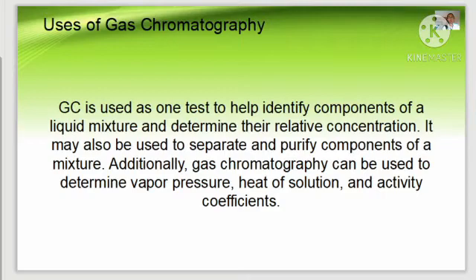So, chromatography can test blood alcohol, drug purity, food purity, and essential oil quality. GC may be used on either organic or inorganic analytes, but the sample must be volatile. Ideally, the components of a sample should have different boiling points.